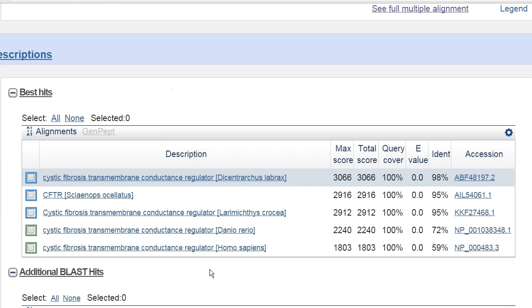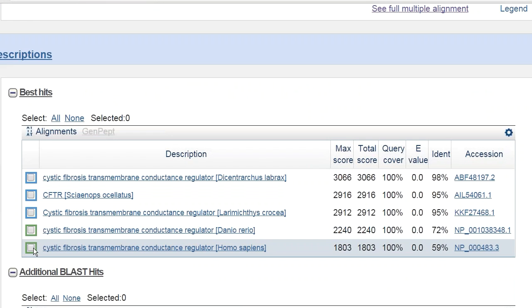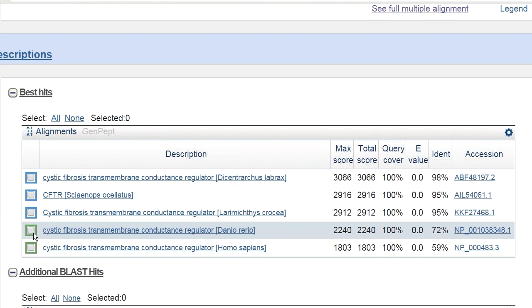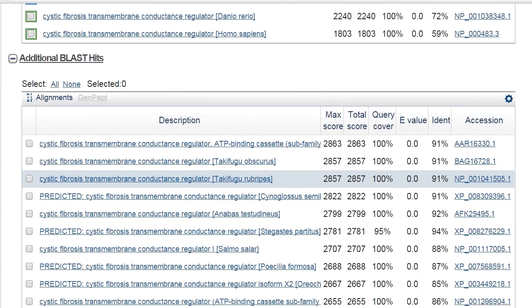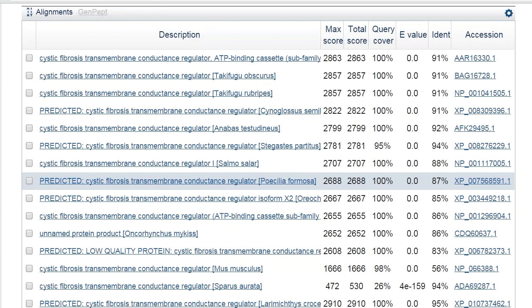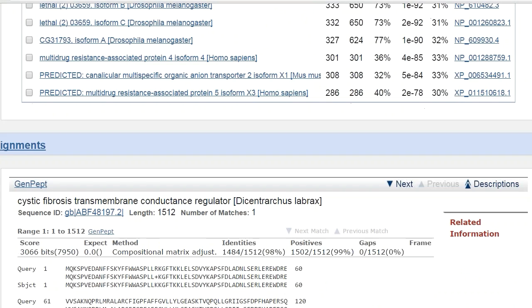Down below I have the five hits I get. The two green ones are the more distantly related ones from the landmark database. The three others are from the fish species we saw in the tree above. These are additional BLASTP hits saved from both the landmark database search and the KMR search against NR. And of course you have the traditional BLAST alignments down here if you want to see them.